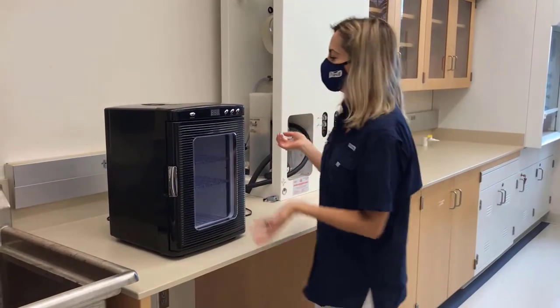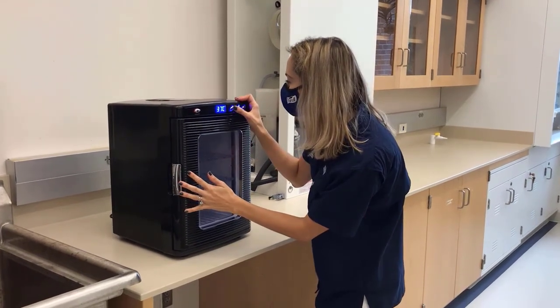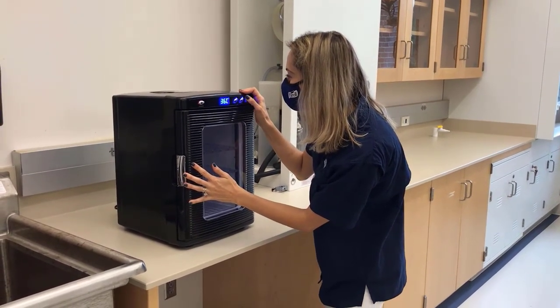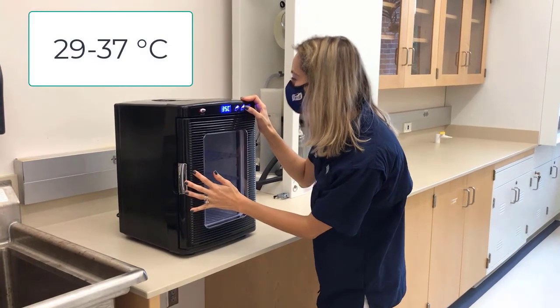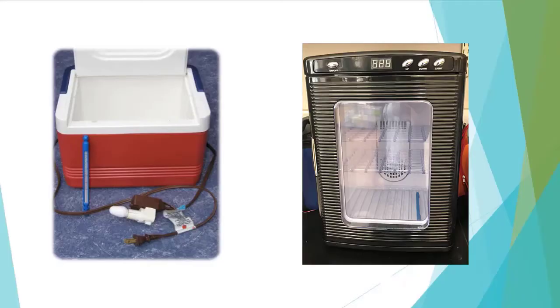Lastly, before we head out the door, it's a good idea to turn our incubator on so that it has time to reach the desired temperature, which should be between 29 and 37 degrees Celsius. The way you set your temperature will depend on the type of incubator you are using. You'll find more information in your manual and additional videos.